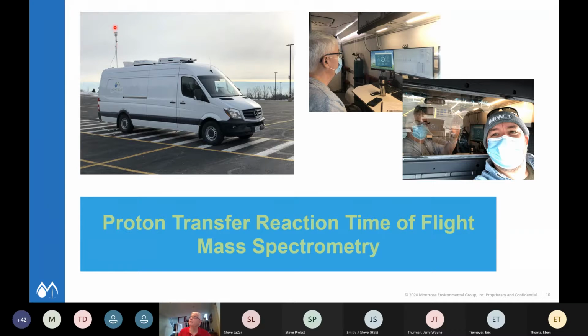So at the very top is the meteorological station and the GPS receiver head, and then you can sample this way. Also at the top, it's kind of hard to see in this picture, I apologize, but there's a boom here that can also be deployed out in front of the vehicle, and we can sample in front of us if we think there's something that's going to be interfering behind us. So we will deploy this out.